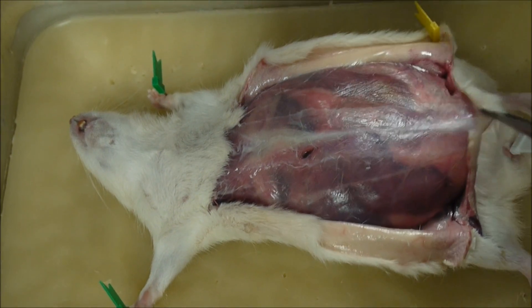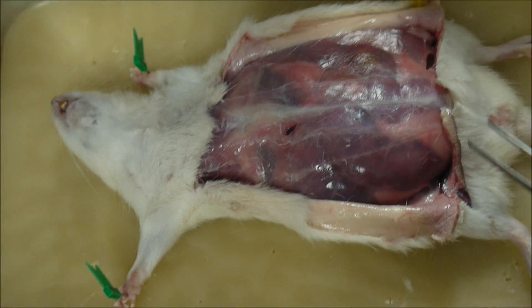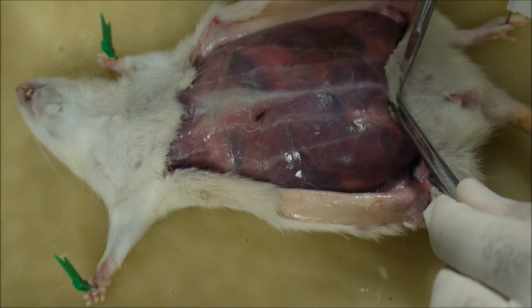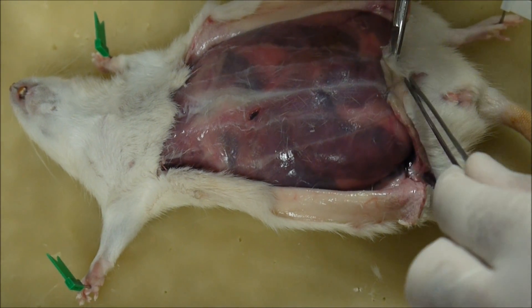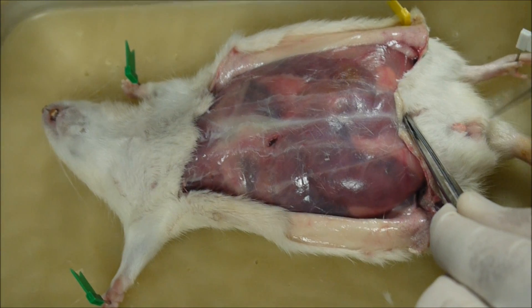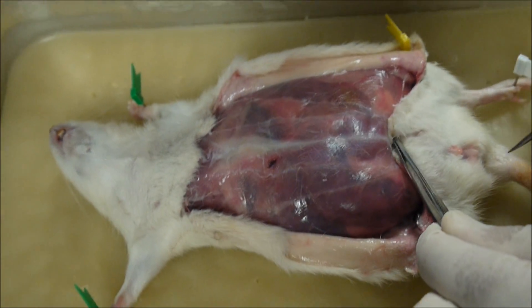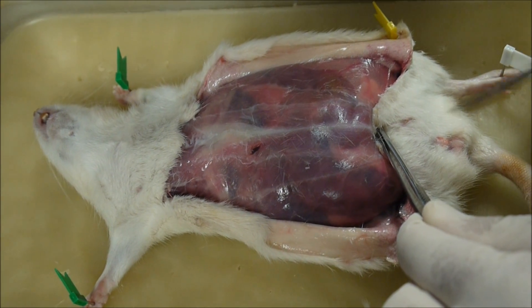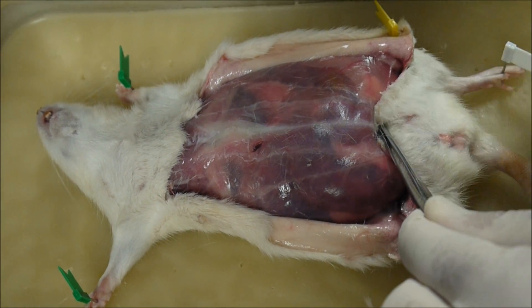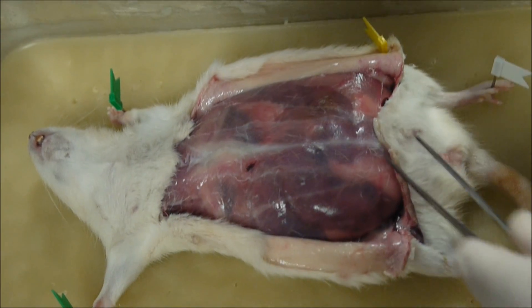Now let's also identify some of the openings. You've got the vaginal opening here, the urethral opening — the urethra through which urine comes through — the vaginal opening, and the anal opening. So three openings. We call them the urogenital triangle. Three openings.